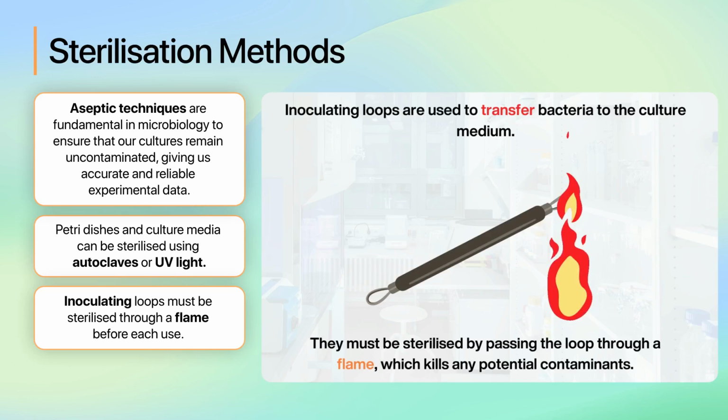Inoculating loops are also important. These tools are used to transfer bacteria to the culture medium. They must be sterilised before each use by passing the loop through a flame. This process kills any lingering microbes that could contaminate the sample.